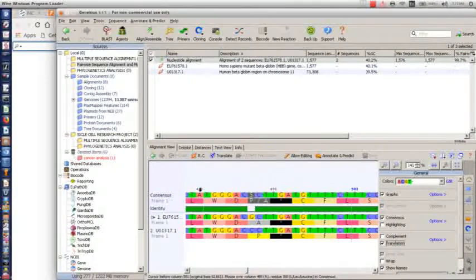So we have a consensus sequence, and the consensus sequence has its own protein sequence, while the mutant sequence has its own protein sequence, and the normal sequence has its own protein sequence, as you can see. Are you getting it now? All these stars you are seeing signify stop codons. Are you getting it? So let's wrap up.